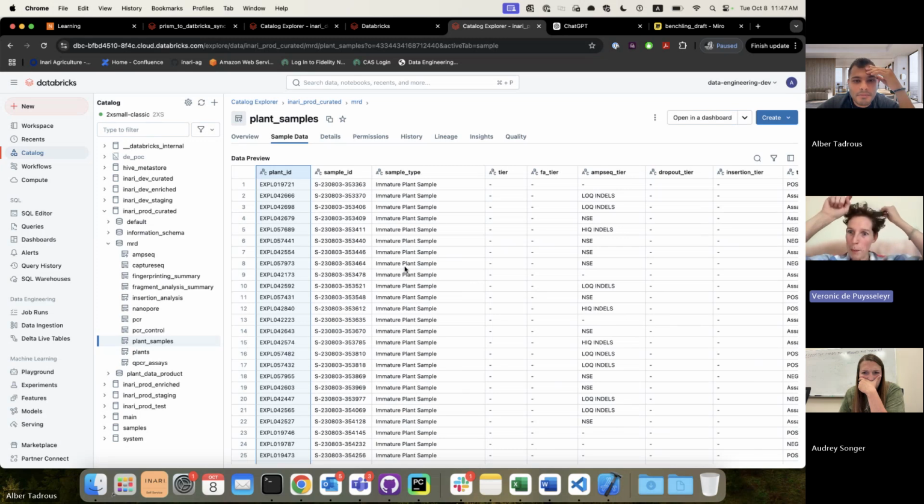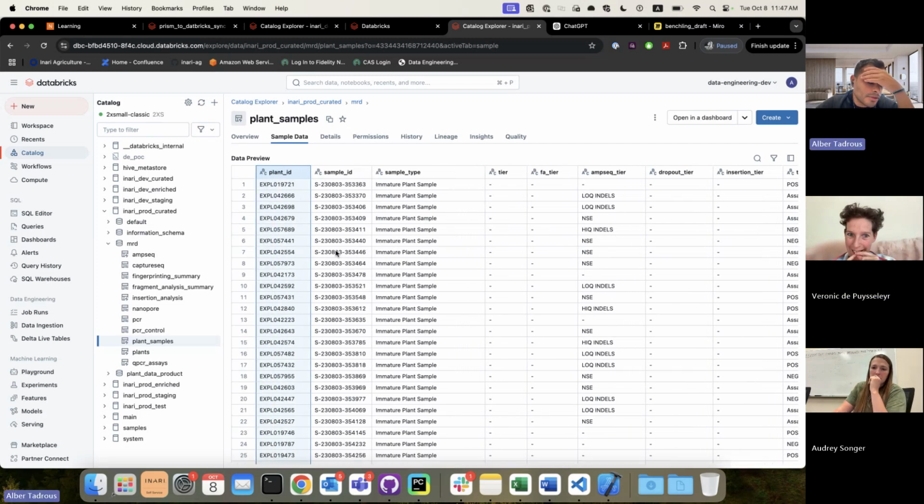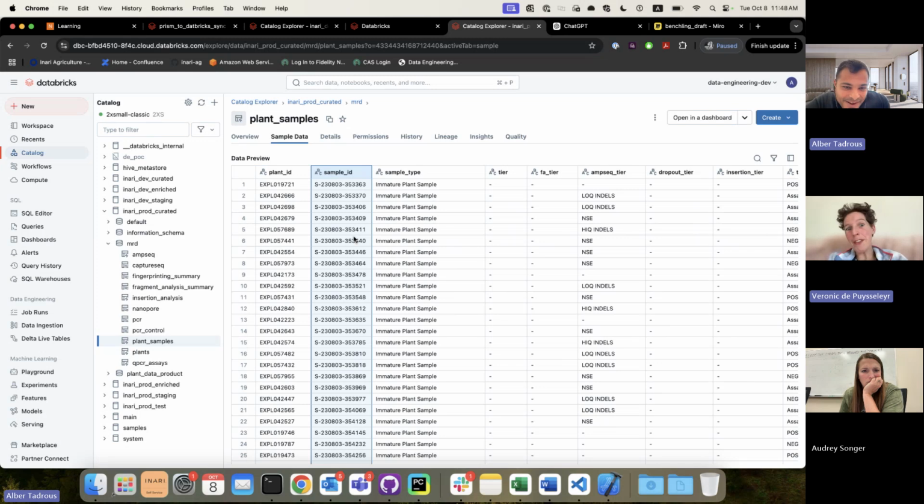You see, in order to be able to fill the parent out in the first column, that is a bit confusing. Yeah, I got your point. The name of the column is not a plant, and it's also not a plant sample. So either you change it to biological sample, and then this becomes plant or condition ID, the first one, and then you can host everything, or you have a separate schema for protoplasts.